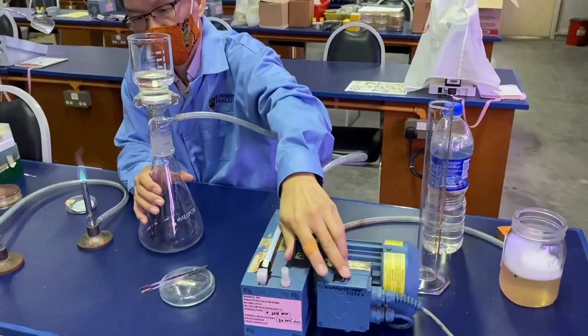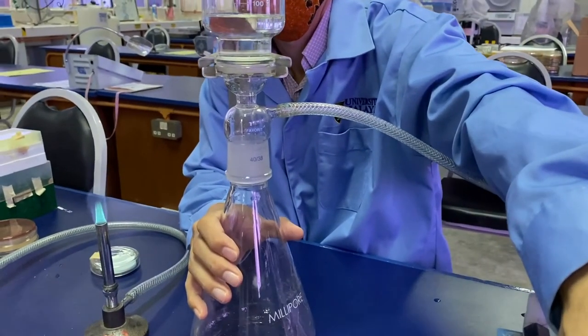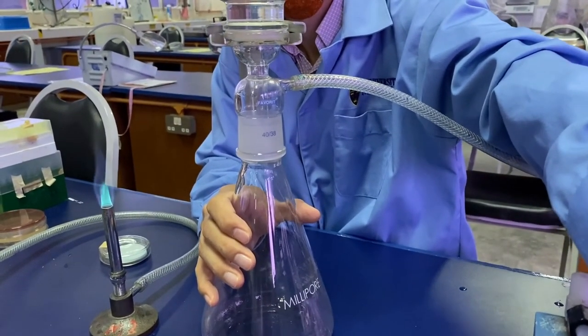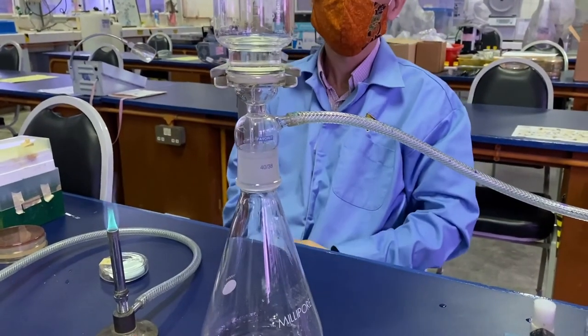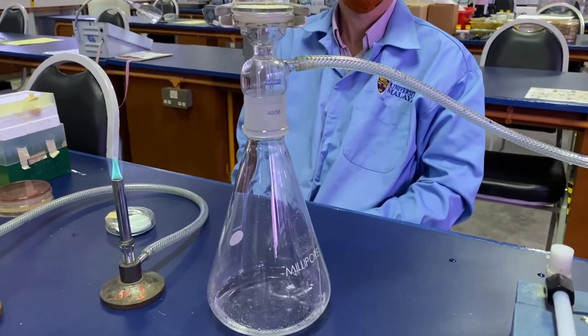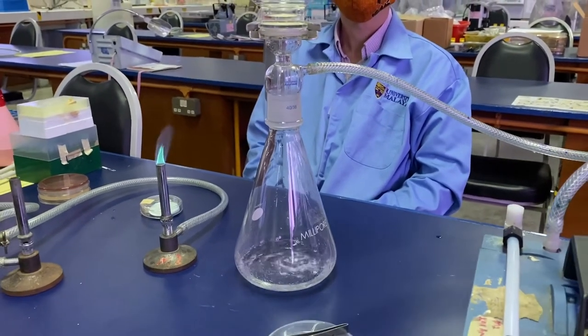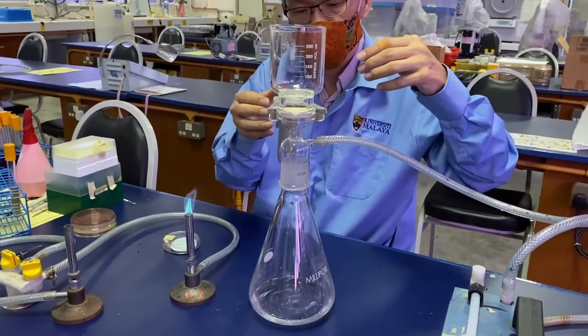Then we turn on the vacuum pump to begin the filtration. Once the filter is dried, you can slowly remove the funnel.